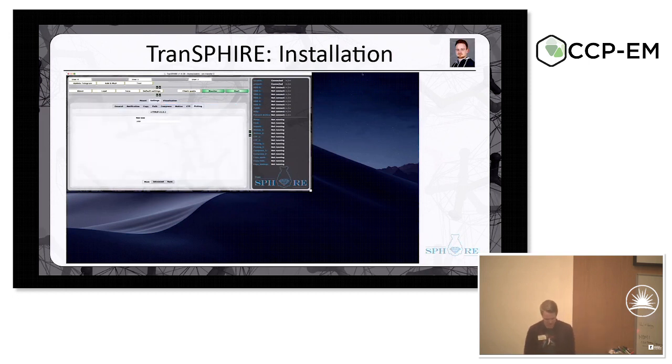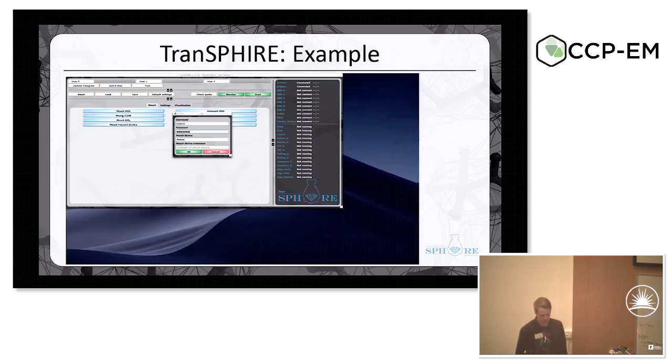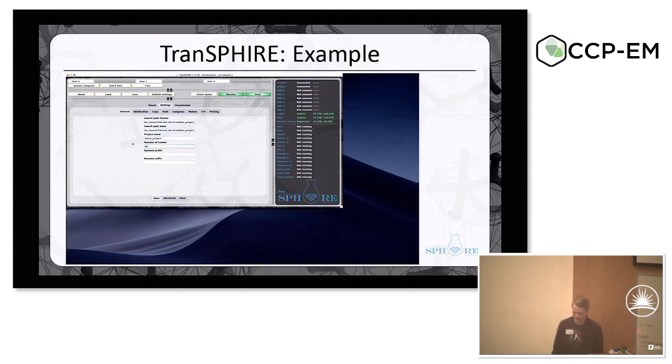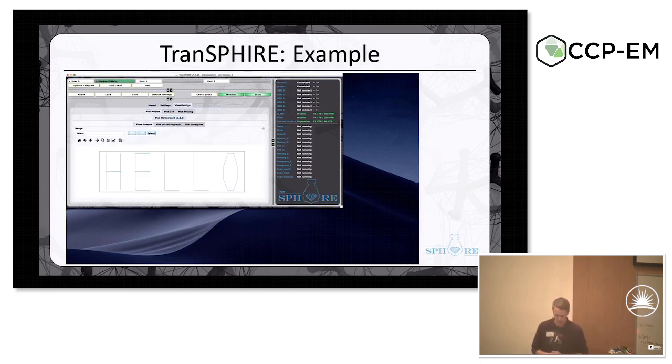And that's it, basically. For an example of how to use it, you give the folders where the microscope will put the images, and you specify a healthy range of your parameters like defocus and so on, where you might want to get notifications, and then you start the process.